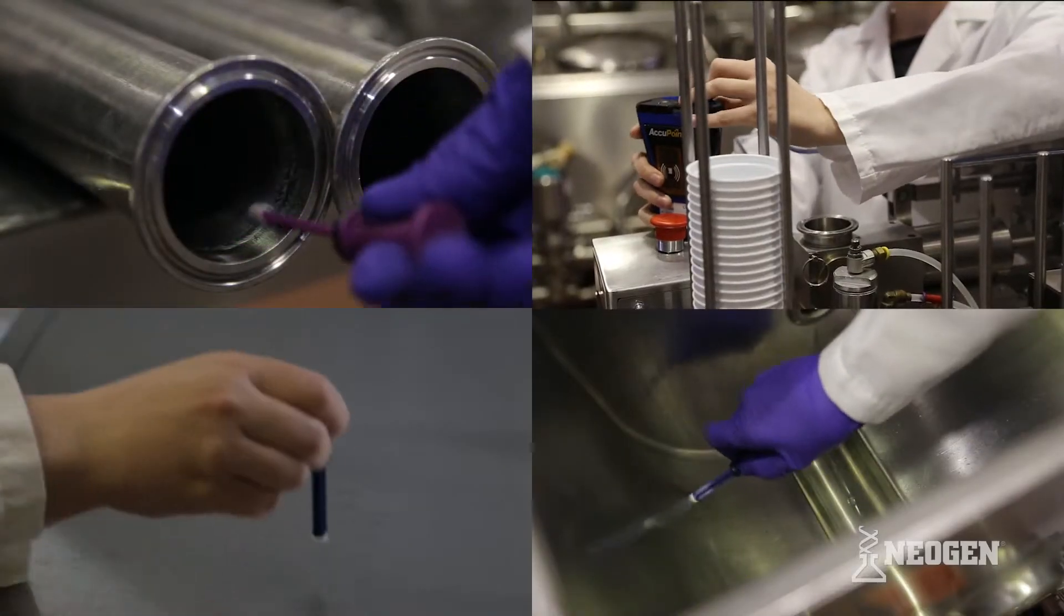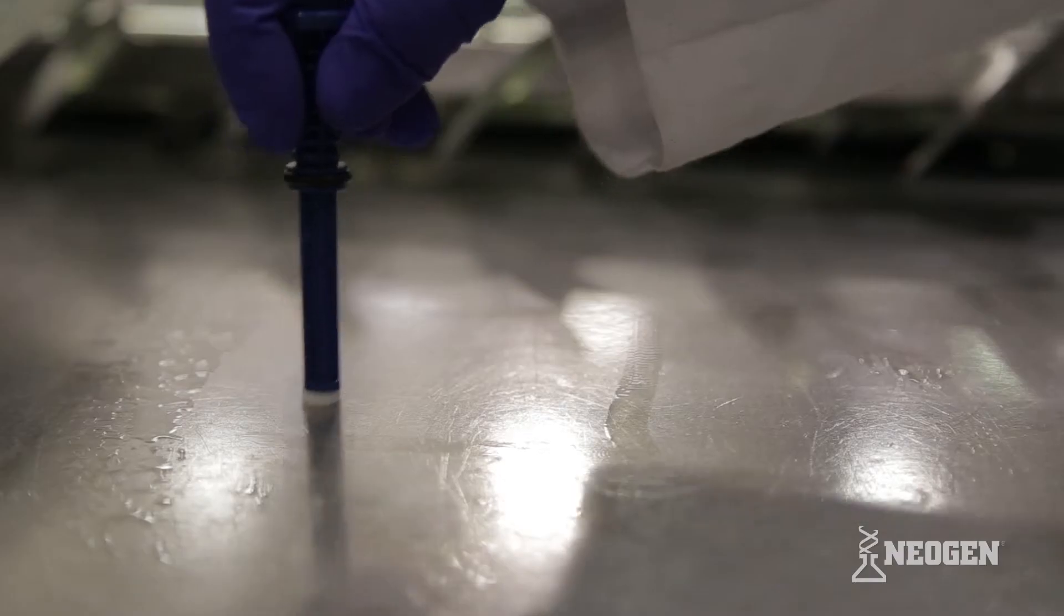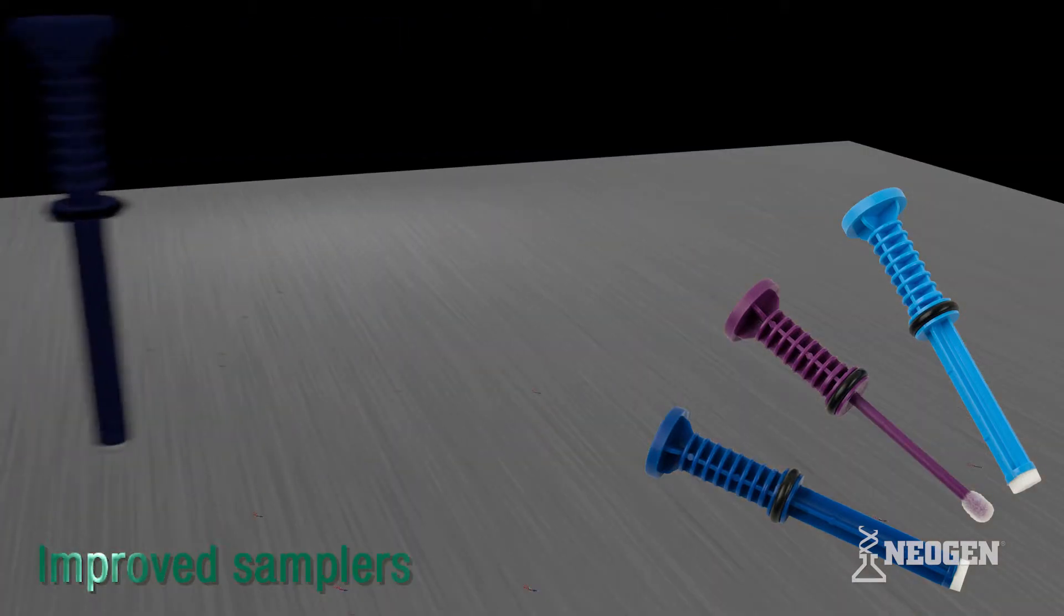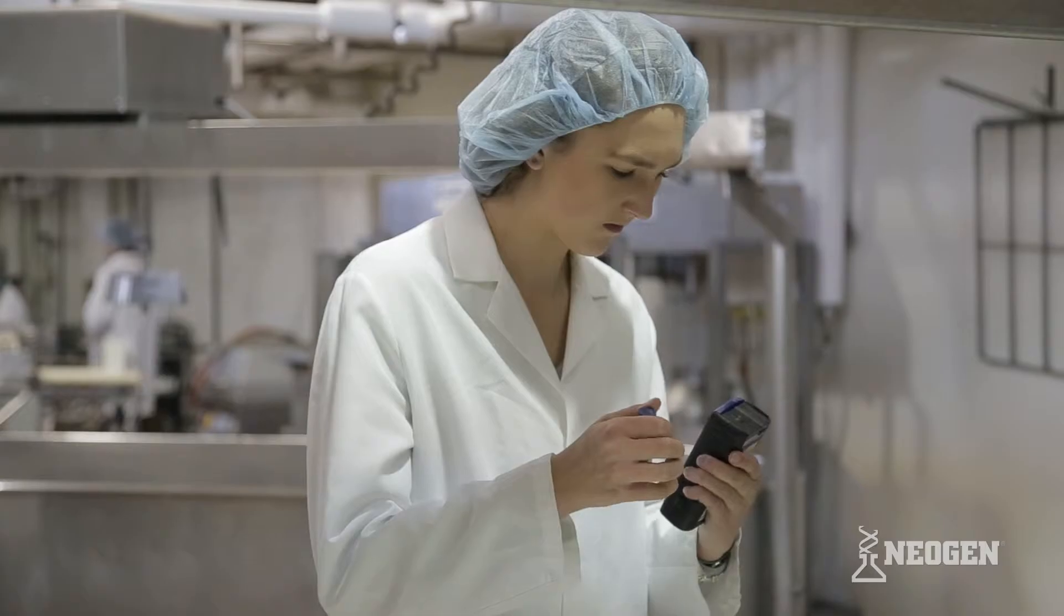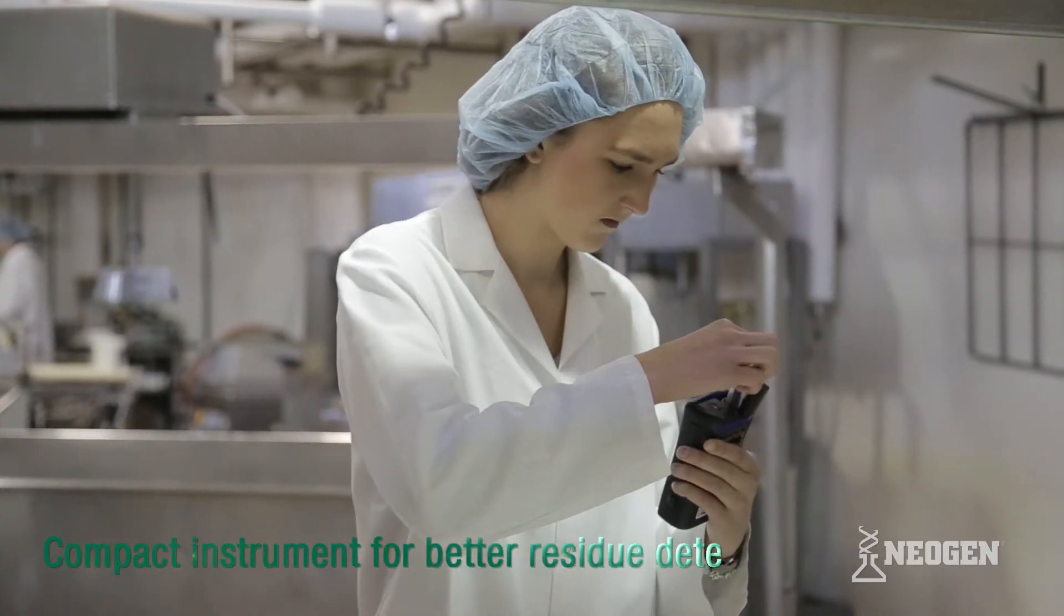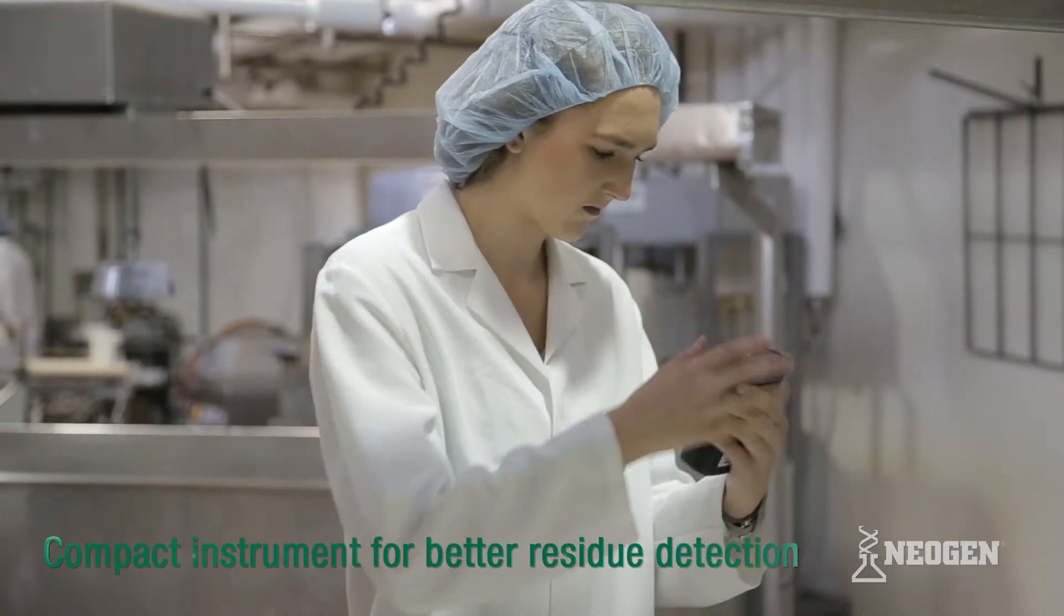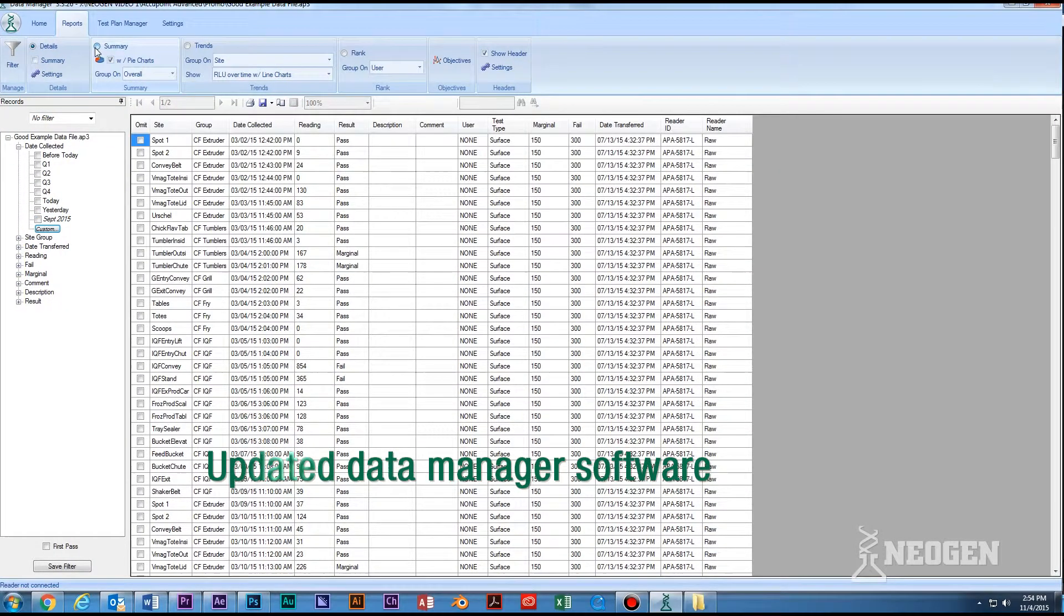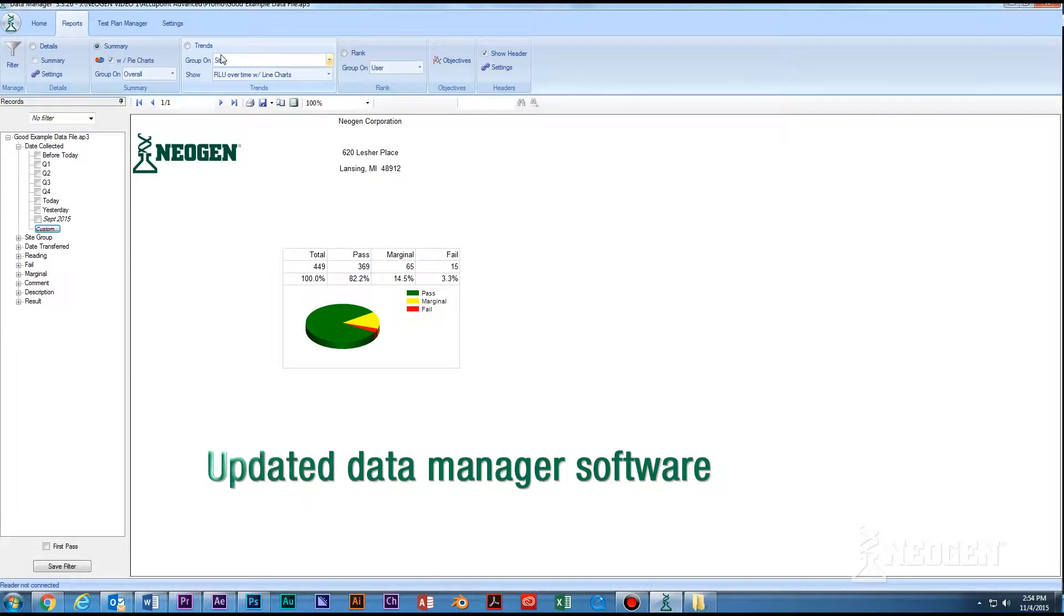The Accupoint Advanced System features third-party validated best-in-class samplers to more consistently collect ATP left behind after cleaning, a compact instrument to detect any residues collected by the samplers, and updated data manager software to better organize and analyze the system's test results.